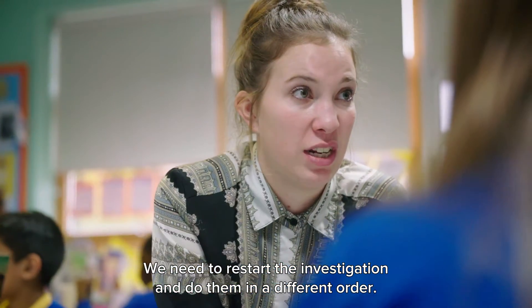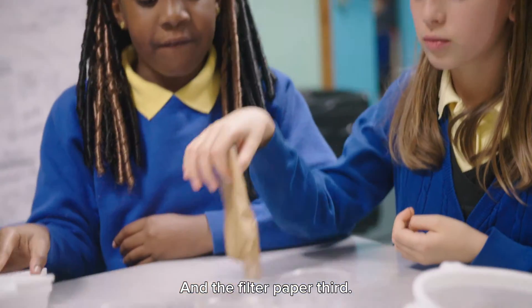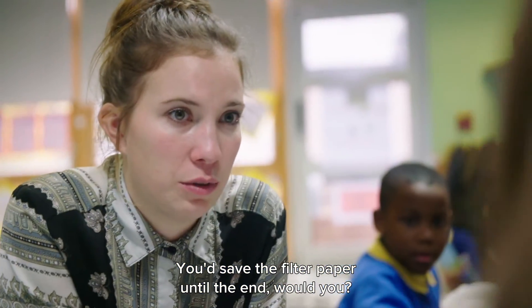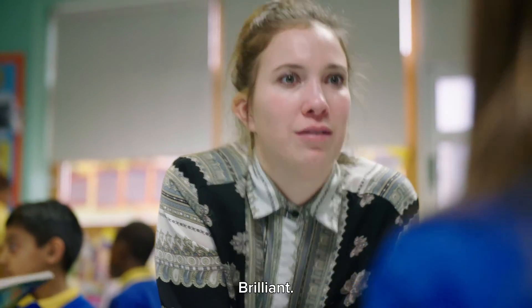We need to restart the investigation and do them in a different order. What filter would you do first? Start with the sieve, that one second, and the filter paper third. So you save the filter paper to the end — yes! Fantastic, because then we can see what each filter has taken out from the water. Brilliant!